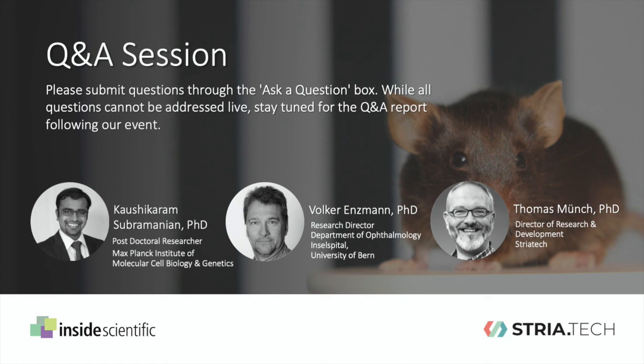Great. So this is a bit of a situational question. The person has stated, in my studies, I only treat one eye and the other eye serves as a control. Thomas, can this be assessed with the Optomotor Reflex?